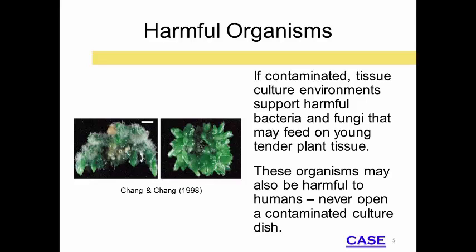Contaminants can feed on tender plant cells and ultimately kill the culture. Other harmful effects can be from bacteria that is harmful to humans. Harmful bacteria, such as strep, can rapidly multiply in the environment meant for cell growth.